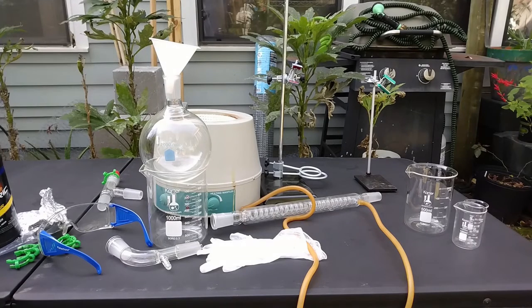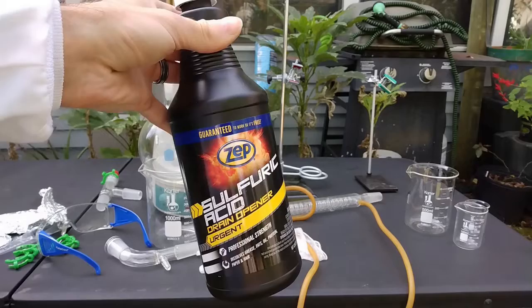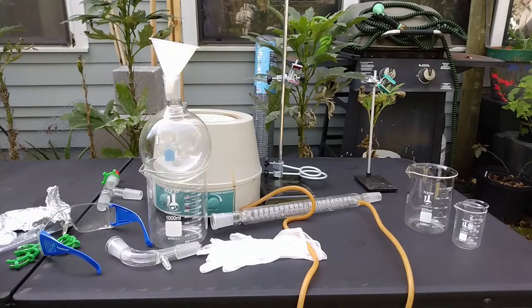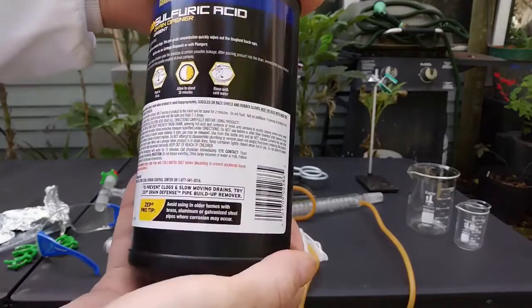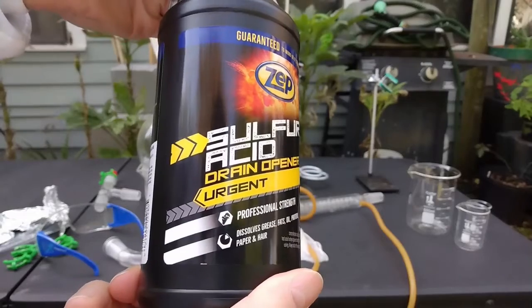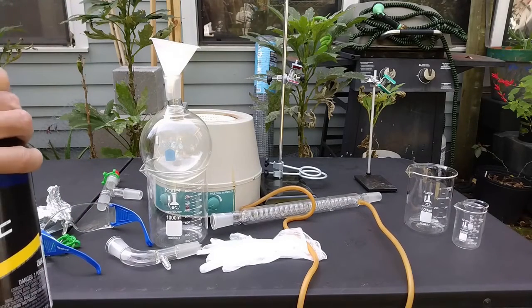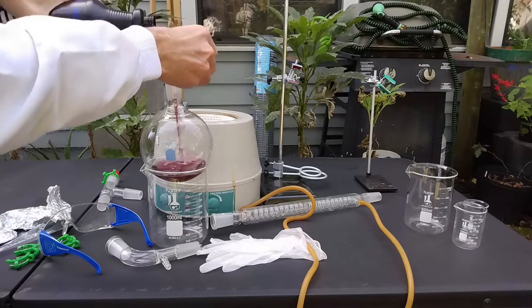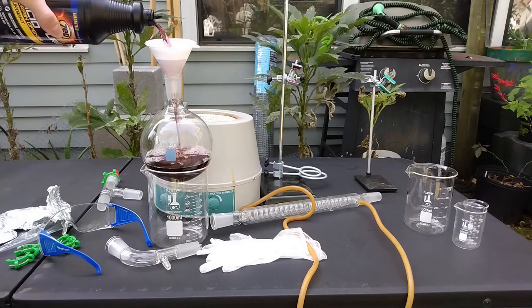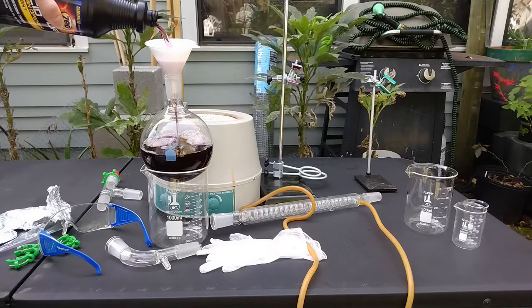Hi everyone, today I'm going to show you how to purify sulfuric acid. It has become very difficult to buy pure sulfuric acid in stores, maybe because of regulations. When we buy something labeled as sulfuric acid with no list of ingredients, we have the right to assume it's pure — but it's not. As you can see, this product is red, so that's definitely not pure sulfuric acid, which is supposed to be colorless.